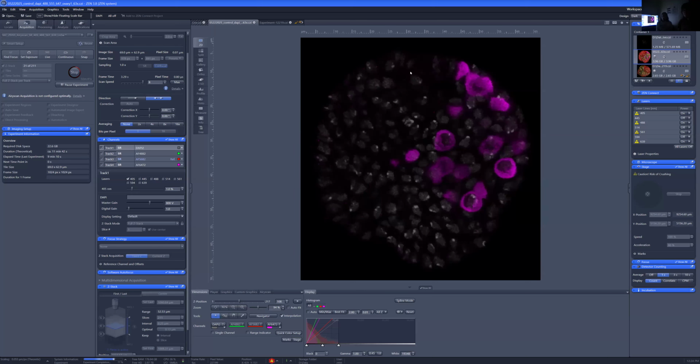And so I image all of my samples, and then I go up to this really powerful computer that we have in the building, that is actually just a gaming PC, because gaming PCs are much more powerful than a normal computer. So you don't even need an actually fancy computer, you just need a gaming PC. But with that, I can run the analysis program, and within about 30 minutes, it can determine the number of egg stem cells in about 20 samples.